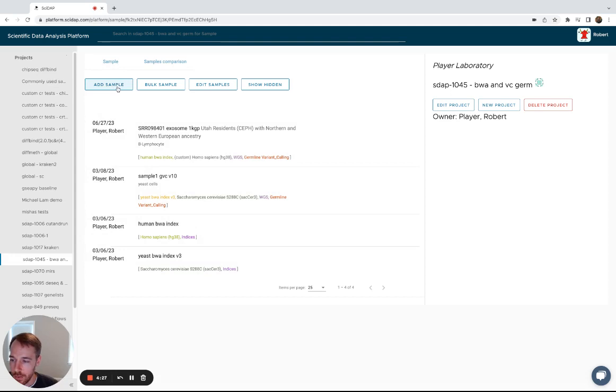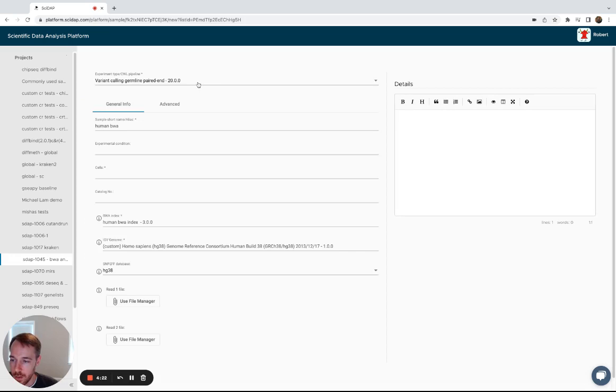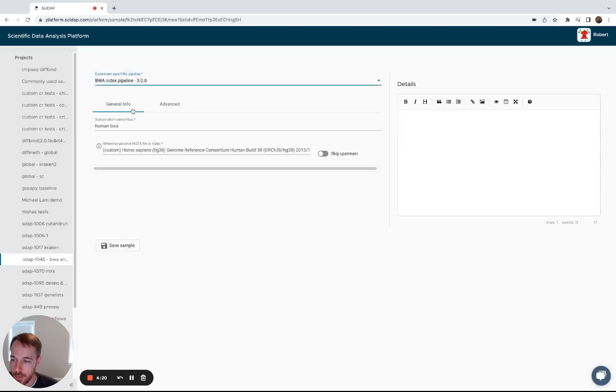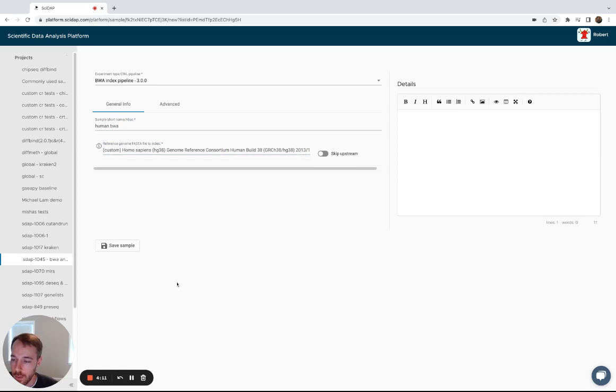So the first step in the germline variant calling workflow is to build that BWA index. You'll click add sample, select that BWA index workflow, name the index sample, and then select the base reference genome that will be used to build the index.